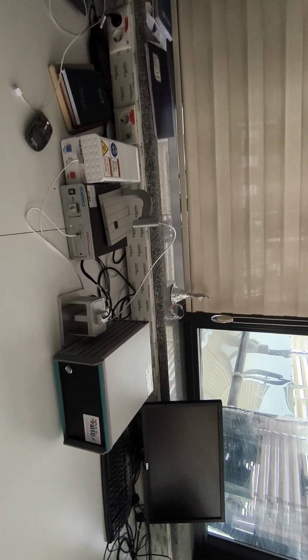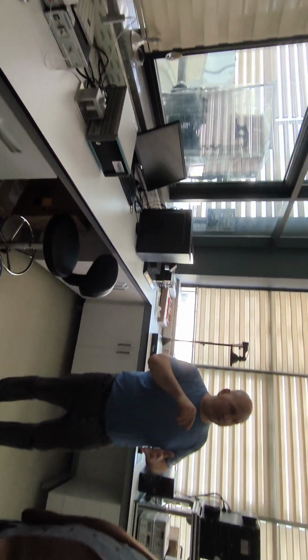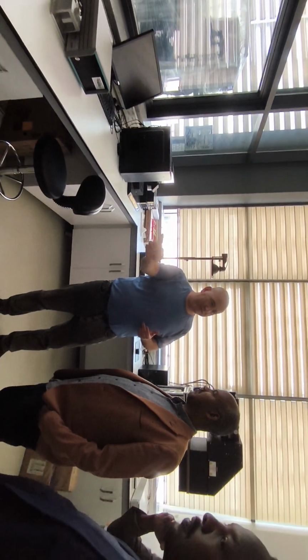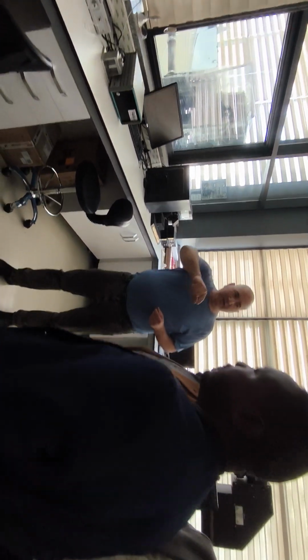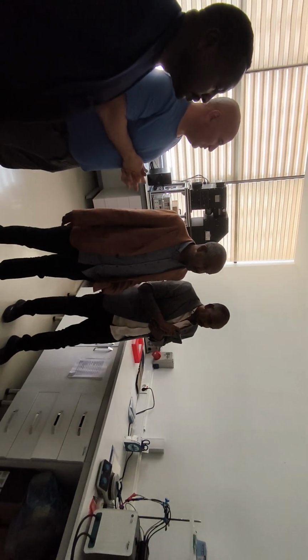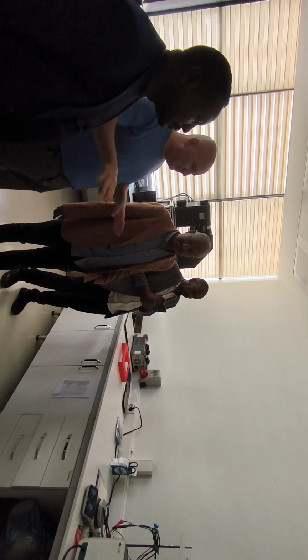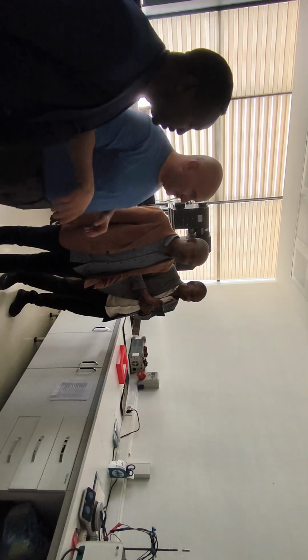Here we have Hall effect, if we need electronic measurement of materials, how many electrons, how many holes. For the battery, electrochemical tests and so on. So if we need to determine this, we use a potentiostat. So here it's for electrochemical and energy.